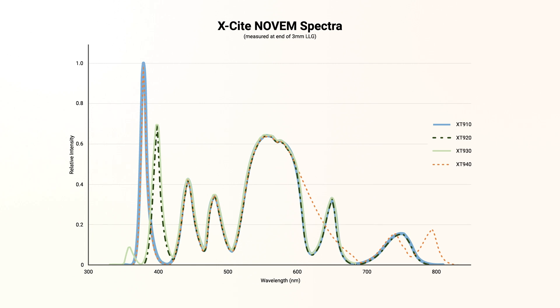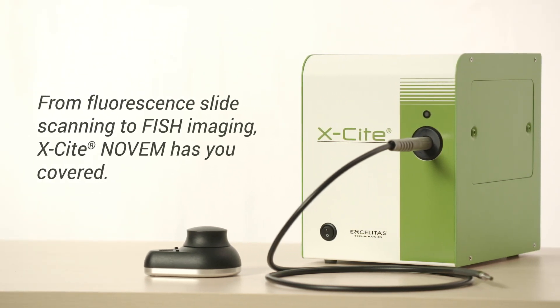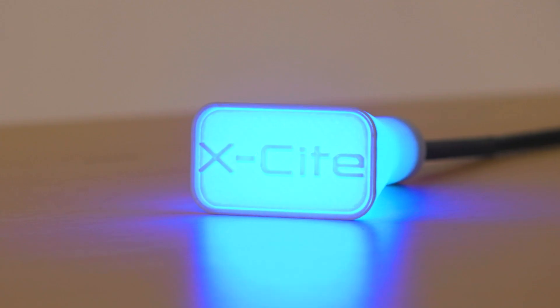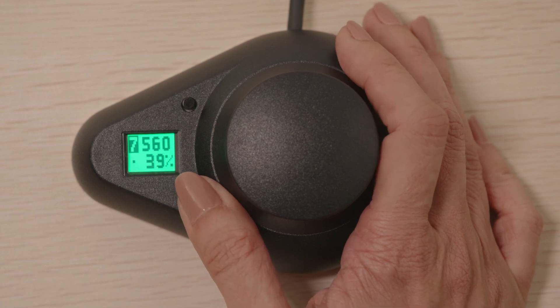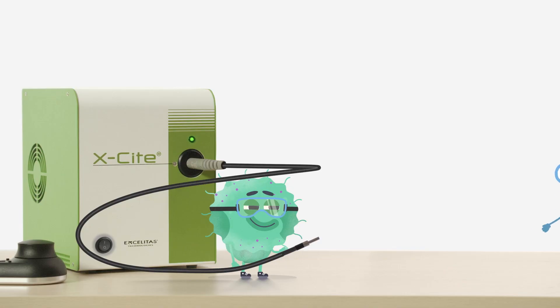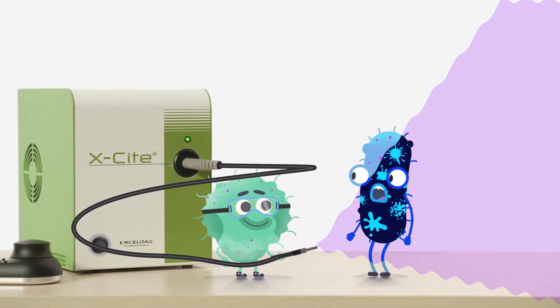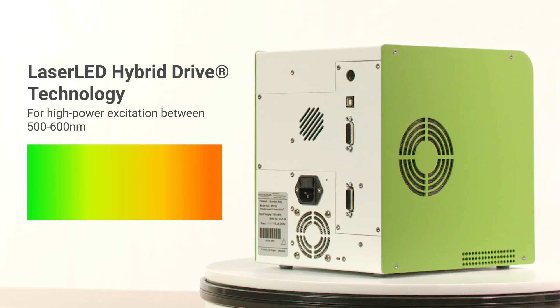So whatever your application — from fluorescence slide scanning to FISH imaging — Xcite has you covered. Each of the nine channels can be controlled through our handy, easy-to-use speed dial or through USB and TTL. Any combination of channels can run at the same time, and the intensities for each channel can be adjusted in 1% increments.